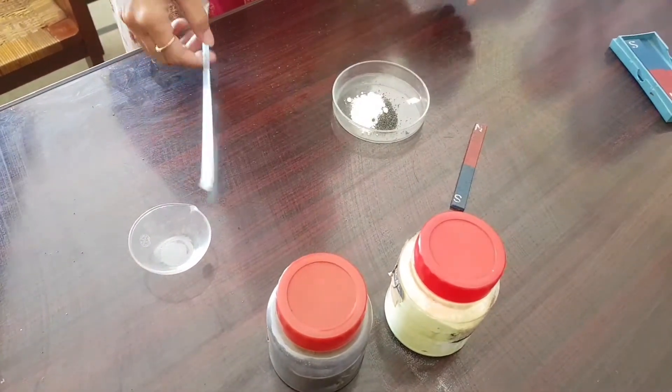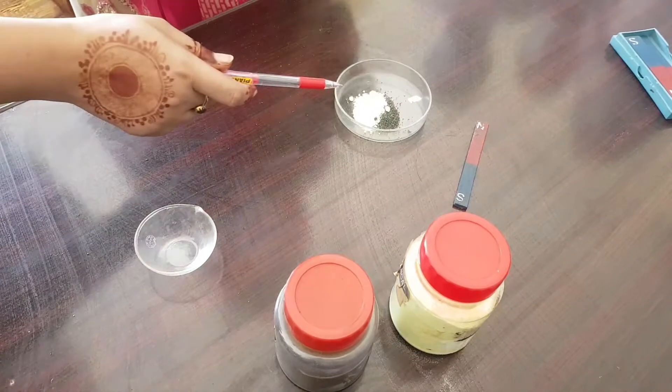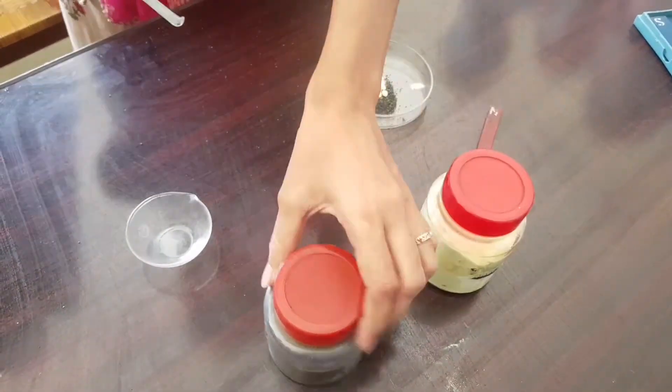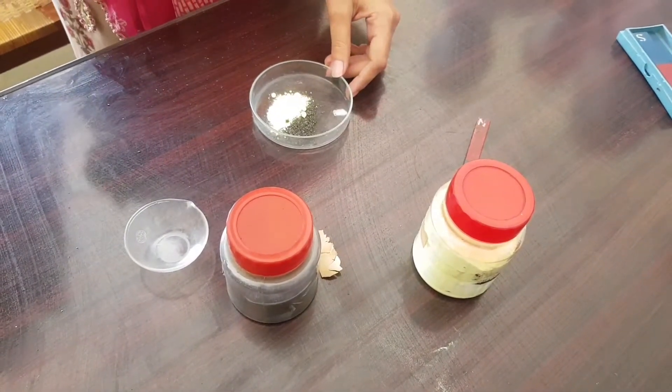The procedure is: take a small quantity of the given mixture of iron fillings and sulfur in a china dish and watch glass, and now separate it.